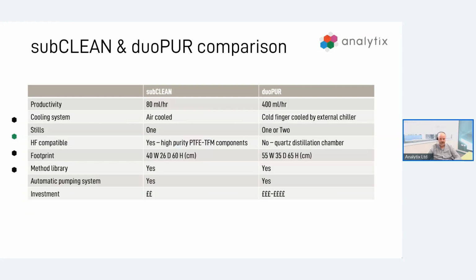Either way, because there is a lot of pressure generated during the run and a headspace of acids created during the run, these will seep into the walls of the vessels and remain there after the run. So cleaning microwave vessels is a critical component to ensuring that you're not getting transference of these waste gases from run to run. Maintaining the cleanliness is essential not only for the blank quality, but also for safe operation as well.